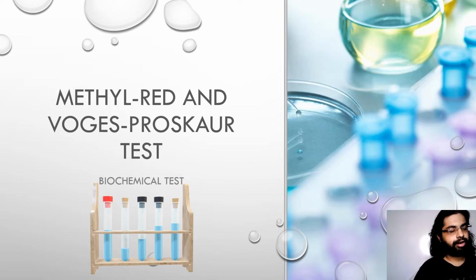Now a question that will come to our mind is, why are these tests performed simultaneously? This is because a single isolate or culture of microorganism will show opposite results for the Methyl-red and Voges-Proskauer test. That is, the organism will either show MR positive result, VP negative result, or MR negative result, VP positive result.